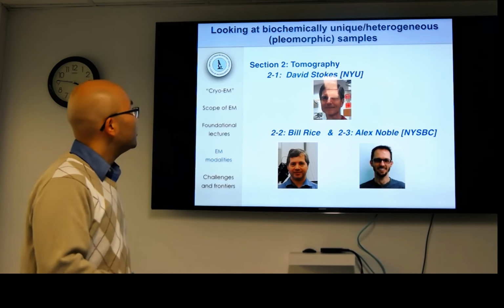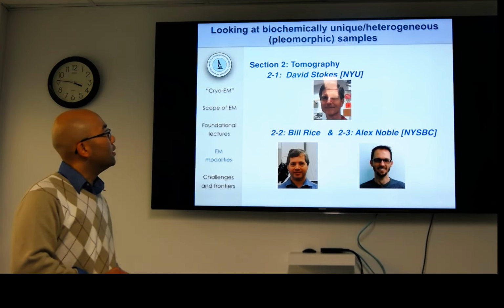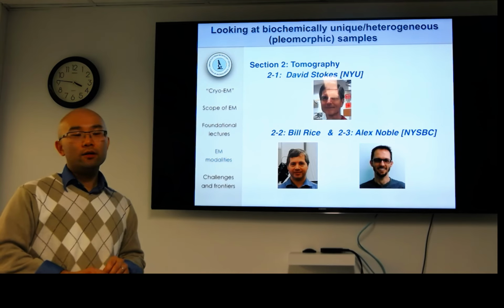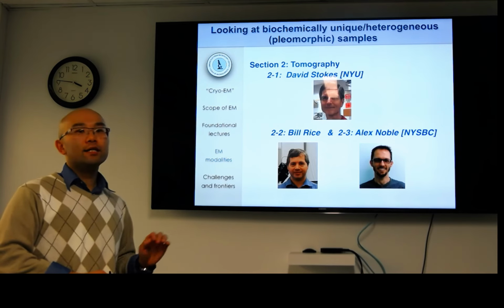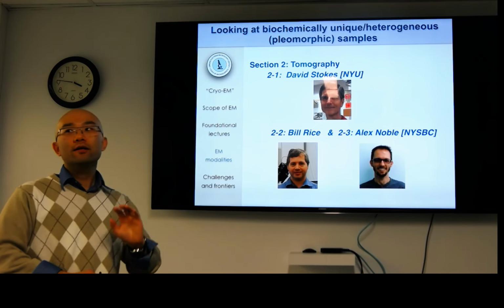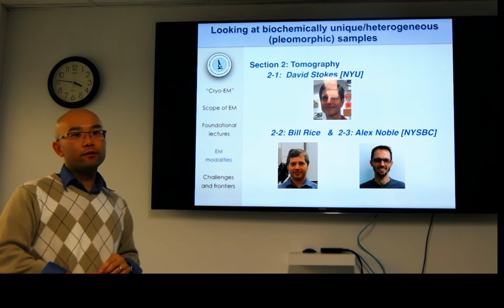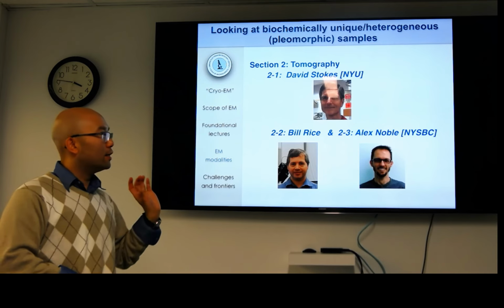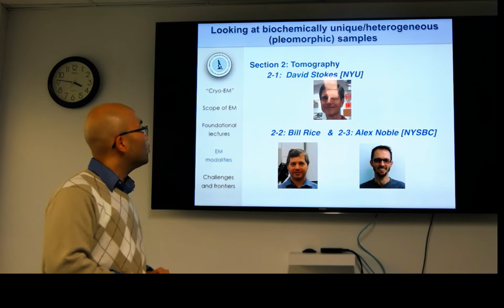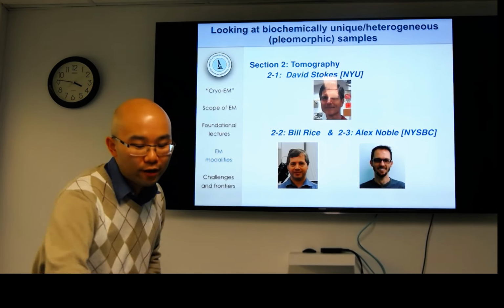And I liken tomography as a very good technique if you have a heterogeneous sample, or perhaps a very limited, unique sample. You might have, for example, a cell, and one cell is identical to another cell, but its conformation or its state could be different. And in that case, it's not the same sample, it's a very unique sample. And therefore, you only have one of it. Therefore, you have to characterize that one.